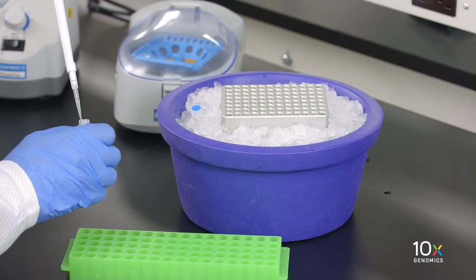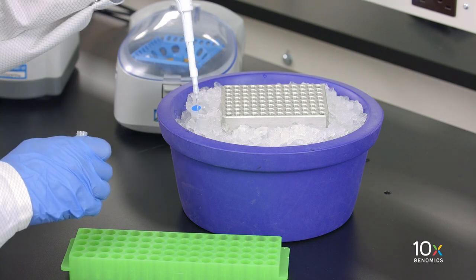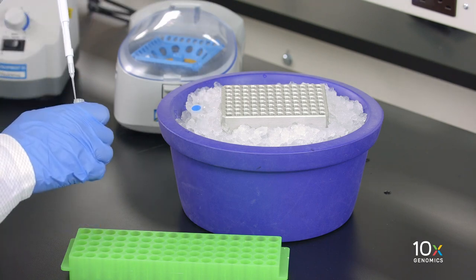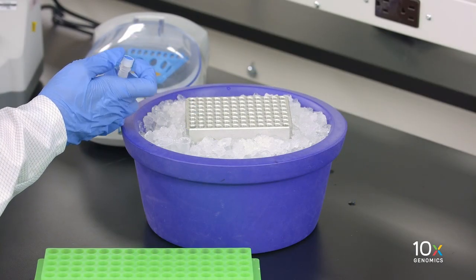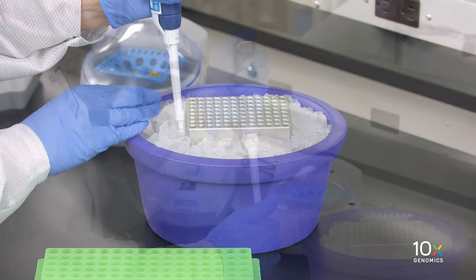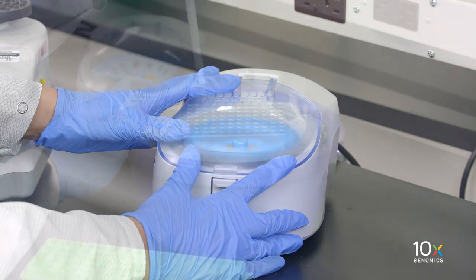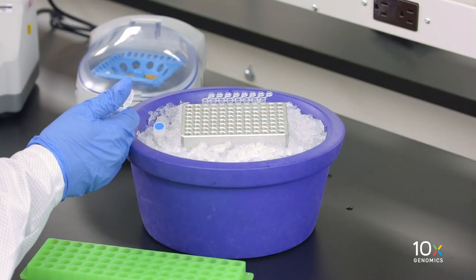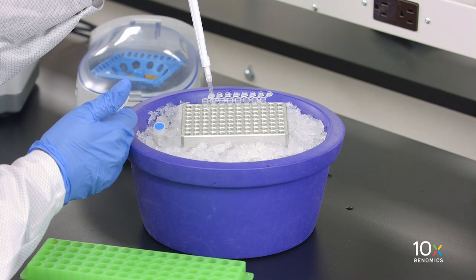We're now ready to prepare the master mix on ice, and we will add the reagents in the order shown in the user guide. First we add RT Reagent B, then template switch oligo, then reducing agent B, and finally RT enzyme C. We pipette mix 15 times and spin down briefly, then aliquot the master mix into each tube of a PCR-8 tube strip on ice.